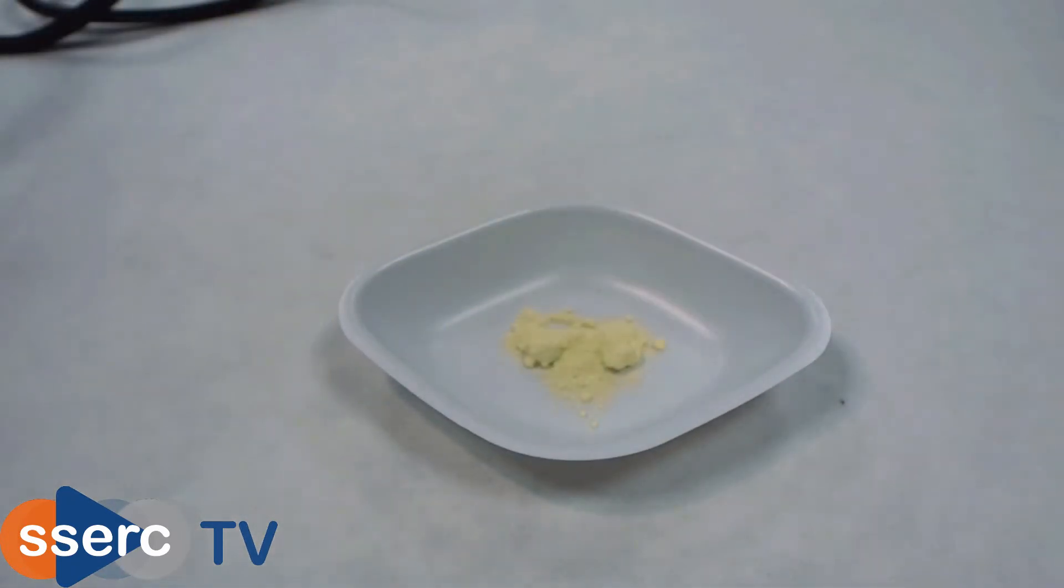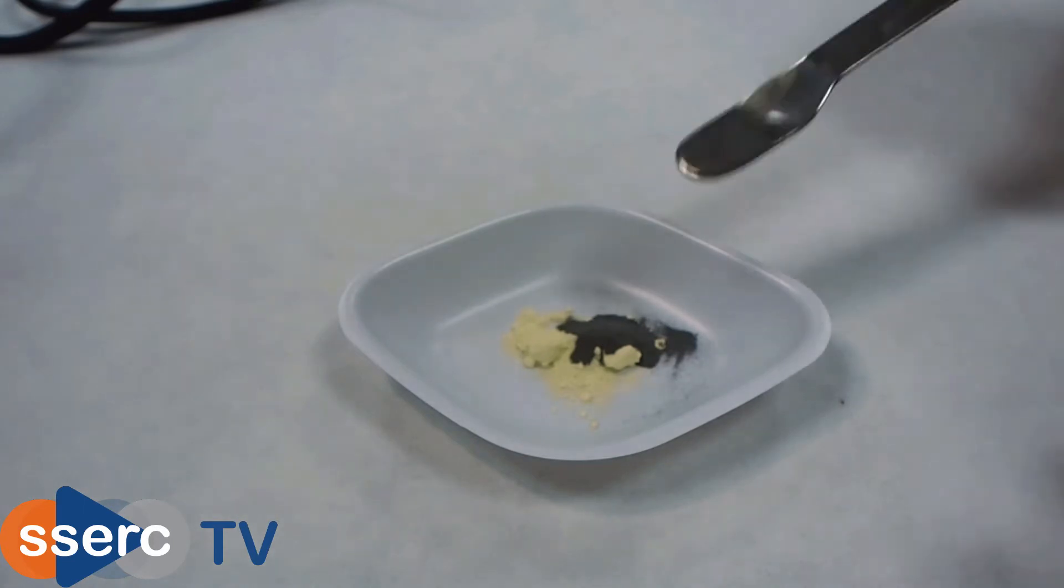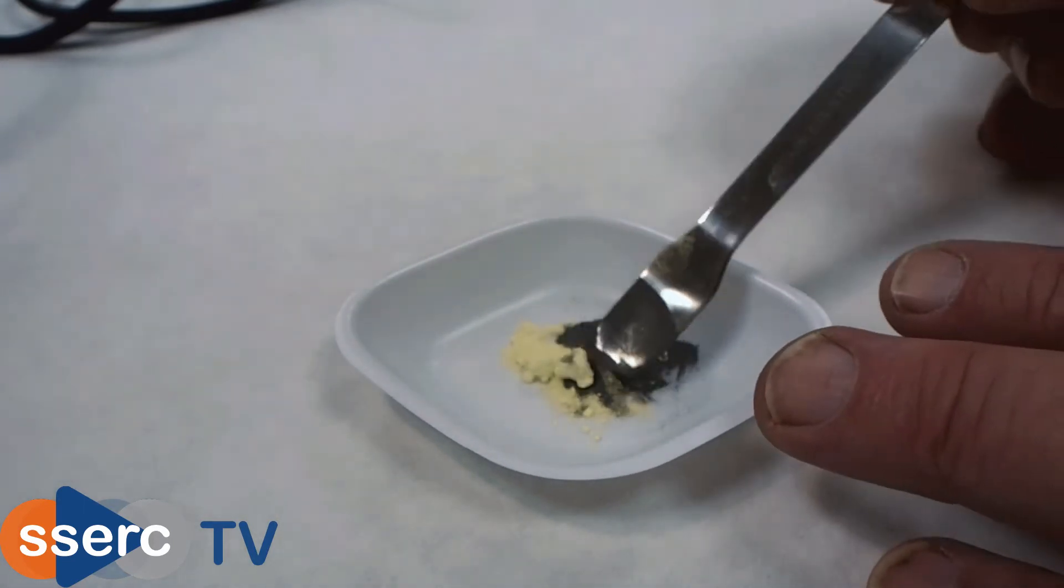Hi everyone. Today we're going to look at the reaction between iron and sulfur. This reaction is often used as an example of a chemical reaction between two elements to make a new substance. Here we're doing it on a micro scale.